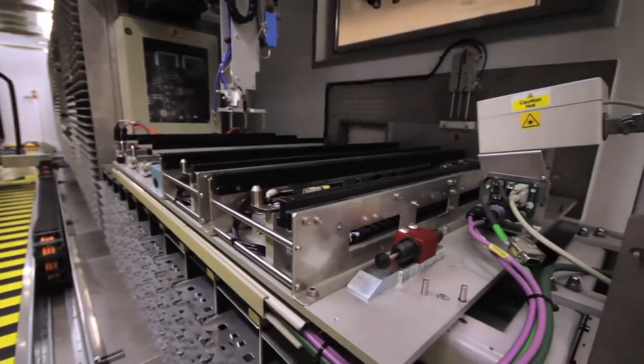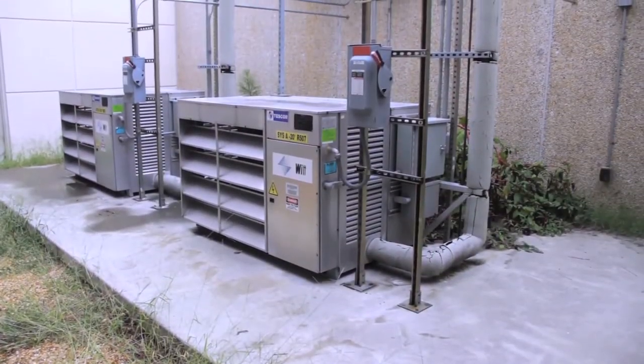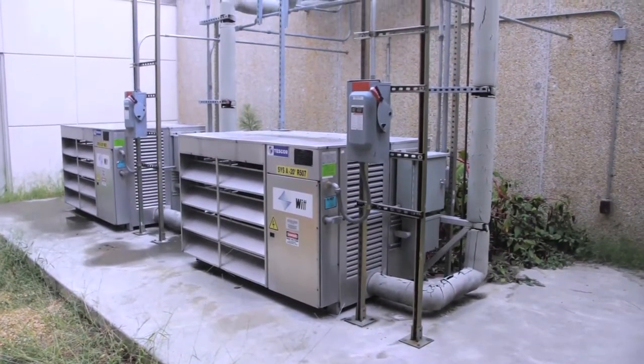The freezer refrigeration is supplied by two Tescor refrigeration compressors, which are concrete skid mounted outdoors, supplying two Larkin Heatcraft condensers.